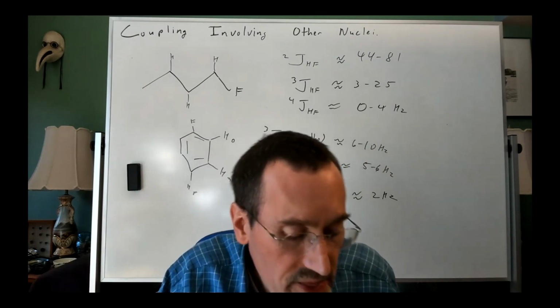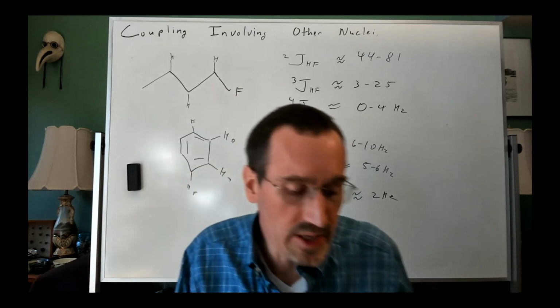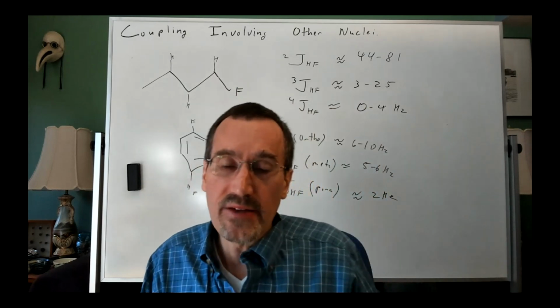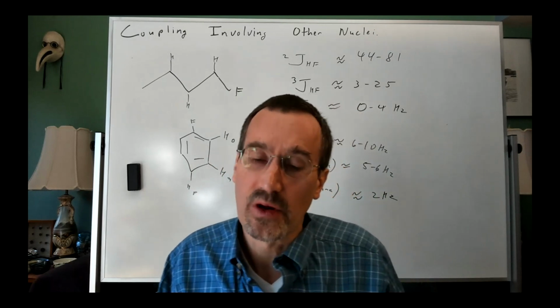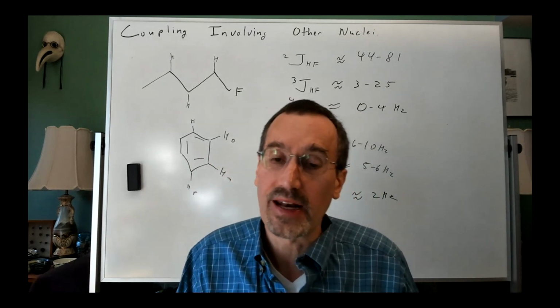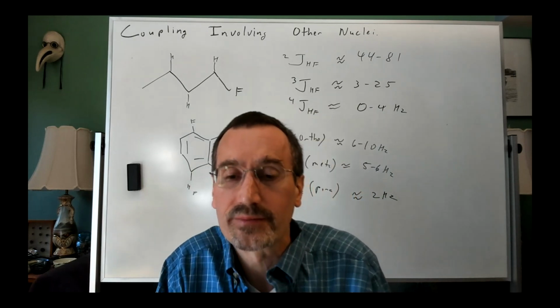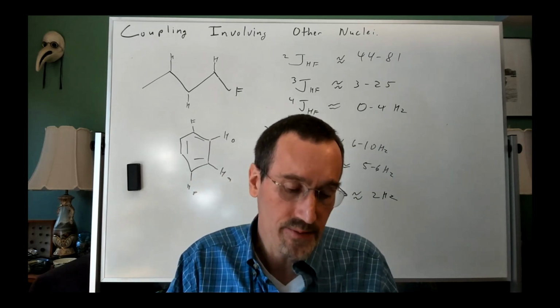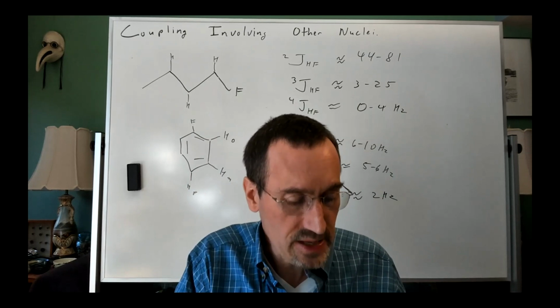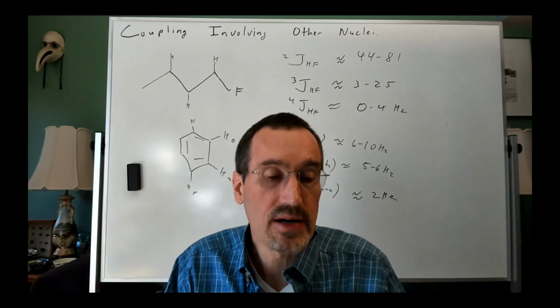All right. Well, I think what I'll do next time, as I hinted at, is we're going to continue and give you a preview of some of the things that you're going to see. We're going to look at a compound that has 2 C13s and a phosphorus in it that I've pulled out, and we'll see some really cool coupling patterns. And then I think we'll move on to start talking about dynamic effects in the NMR.